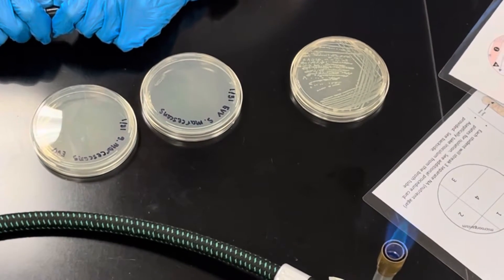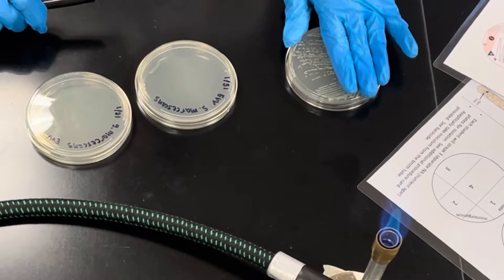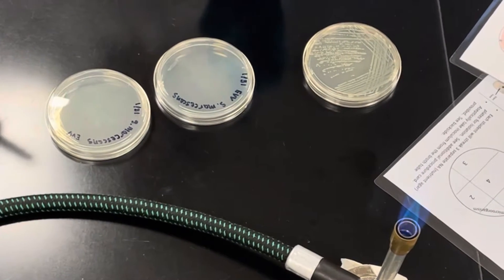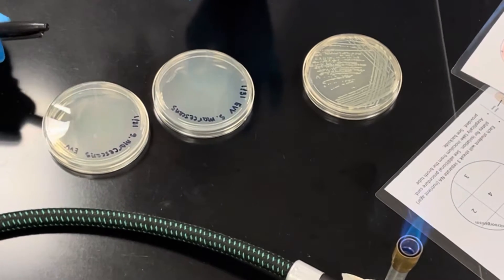Today in lab we're going to learn how to streak for isolation. We're going to be using Serratia marcescens, and you're going to have three plates to streak. There are a couple of different ways to do this, and I'm going to show you two methods so you can choose which one you prefer, or try them both to see what works best.